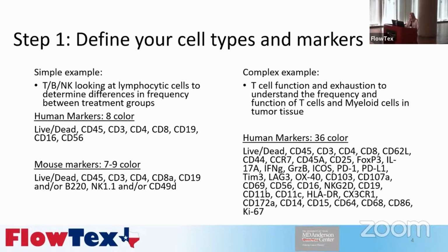And you're going to want to decide what the markers that are relevant to your cells are and know if they're positive or negative on each cell type that you expect to be present in your sample. So when you're thinking about panel design, you have to remember what cells do express and what they don't express. So you want to be looking at that whole context of markers.